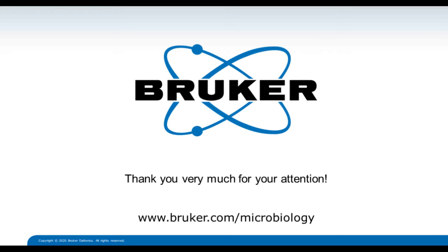So how does the user select the colonies, and how does the Pathfinder locate them? Of course, the simplest way to locate colonies is by eye, but the Pathfinder equipped with a feeder also uses a machine learning algorithm to identify colonies, and these colonies then are proposed for picking. But if the user thinks that his eyes are better, or the machine learning is not always optimal, he also can change that and select another colony if necessary.